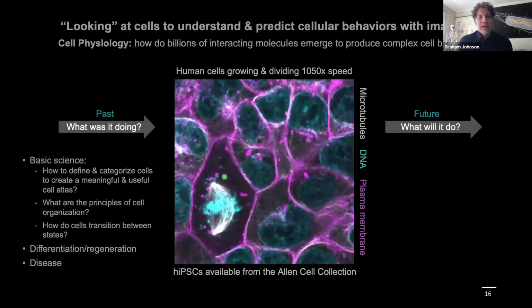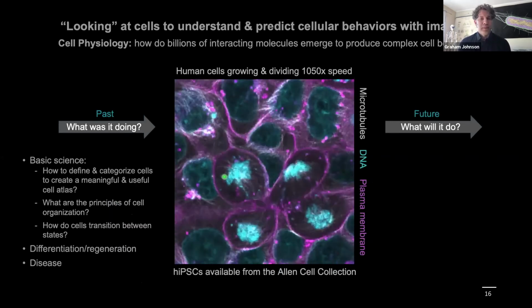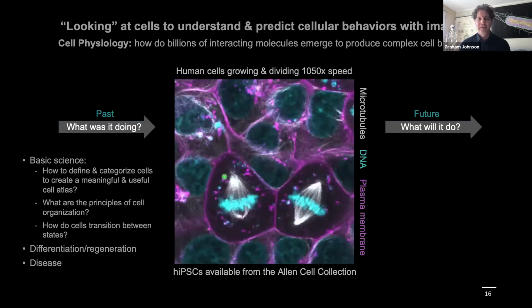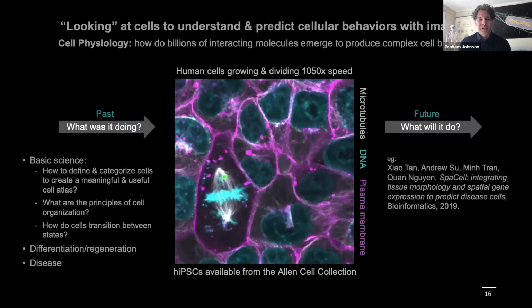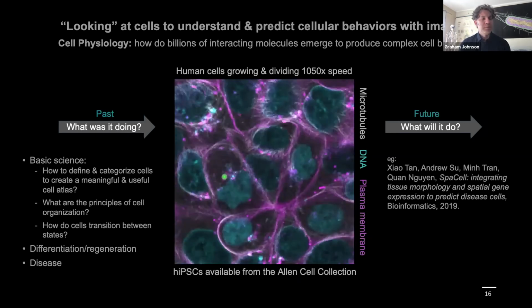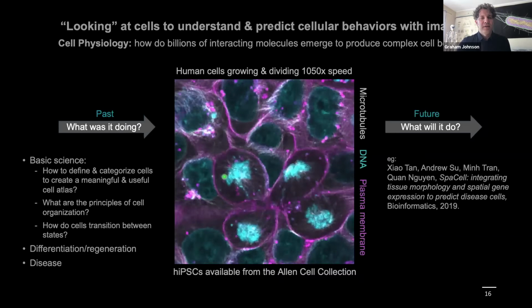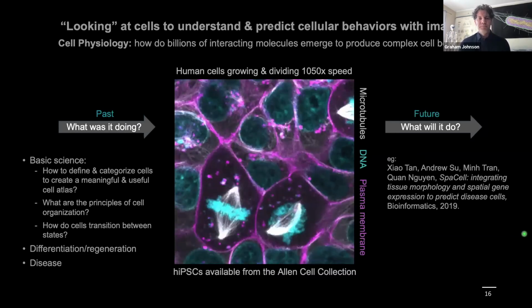What if I gave you the time lapse or let you watch 20 other time series movies of the same cell line under the same conditions for longer periods? Would you then be able to predict when each cell is likely to divide within an accuracy range of, let's say, 4 hours? Or if we layered on spatial gene expression data or other structures such as the centrosomes, instead of just seeing the microtubules and the DNA, would you be able to improve your accuracy? Could you predict any of the cells to within an hour? Or could a computer vision algorithm do any better than a human?